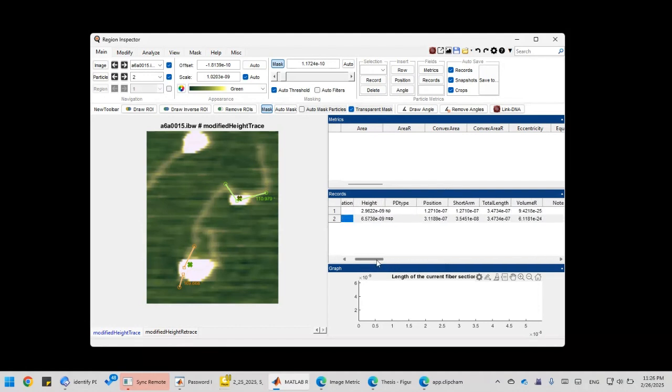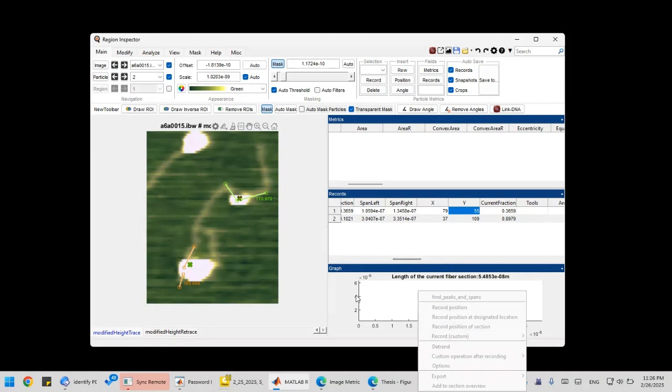Yeah, so now I'm going to show you the script that I'm describing for today's video. In order to use the script, you have to record the XY location of the protein complex. And in order to enable that recording, you have to right click. It's already recorded here. Now, if somehow you have not enabled XY recording, it won't be there.